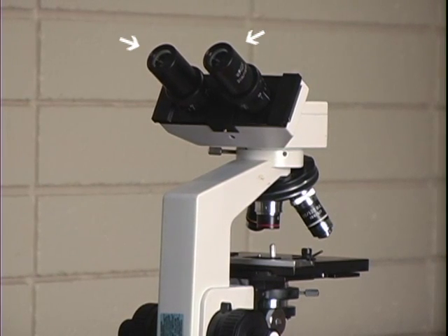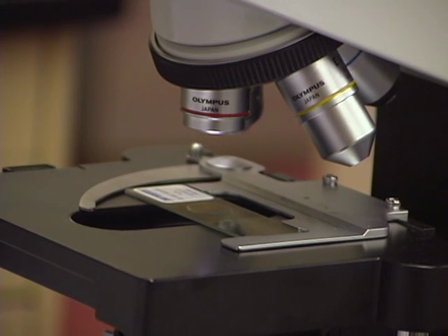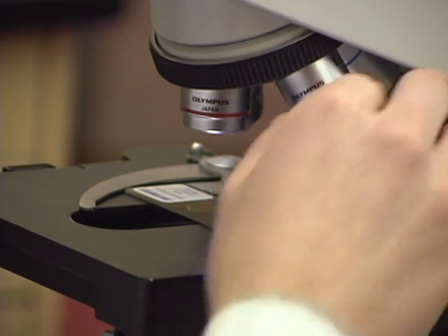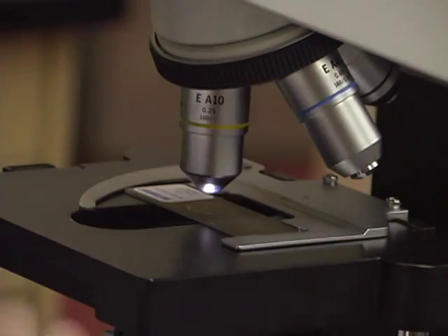Binocular microscopes have two ocular lenses. However, binocular compound microscopes have only one objective lens that can be used at one time, and so the image is only two-dimensional.